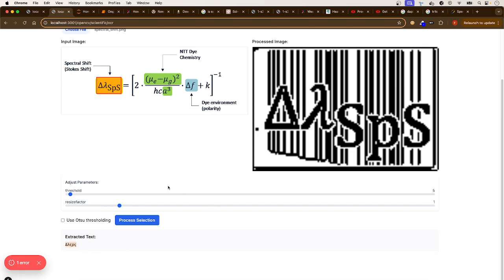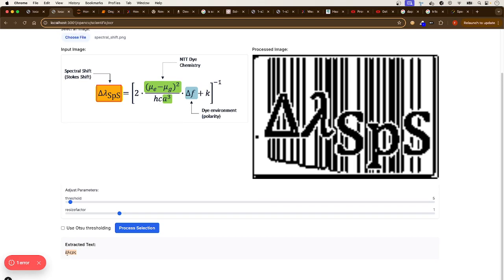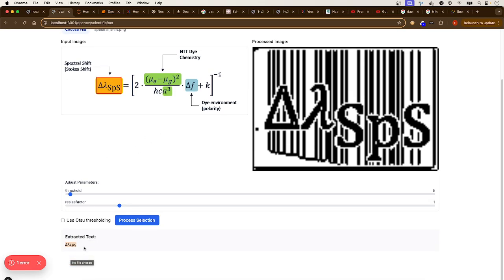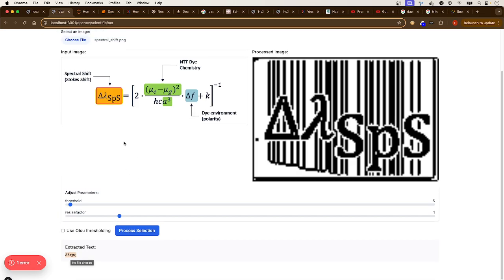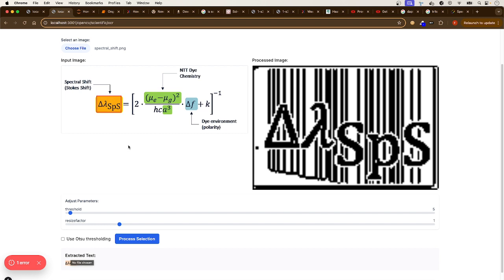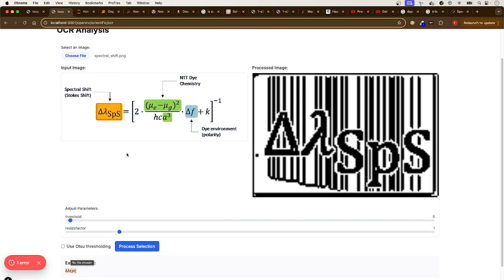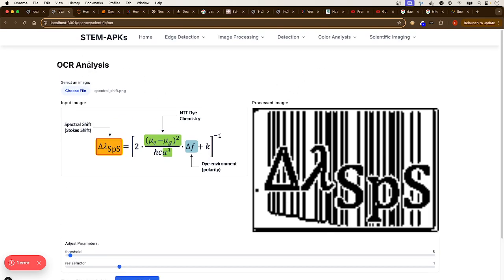And just like that, you can do not only the Greek alphabet, but any alphabet that is compatible, of course, with Tesseract. You can do numbers here. You can do all kinds of stuff. This is just the tip of the iceberg. I'm just showing you this because everybody's going to have a different application, and this can come very handy when you're dealing with certain applications. So this is one thing that I wanted to show you.